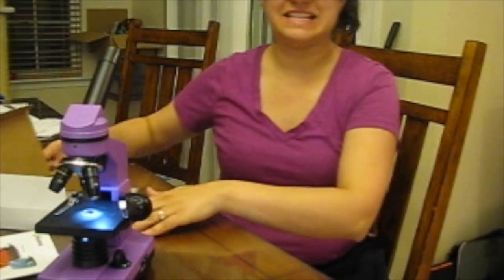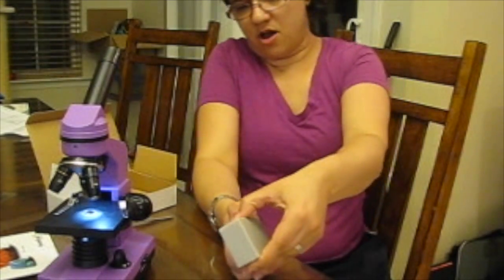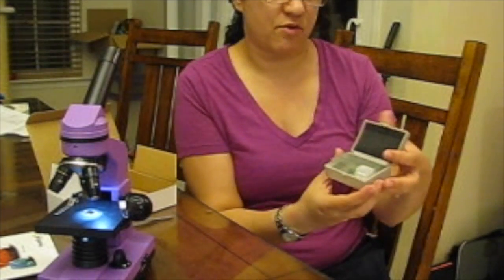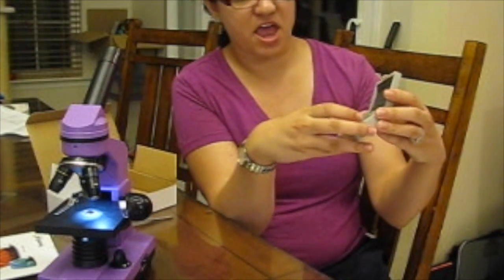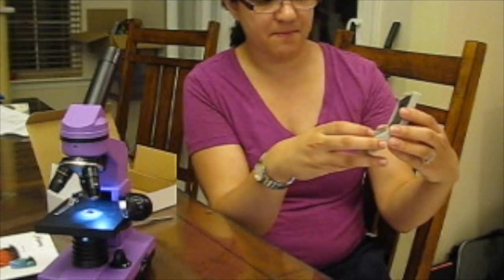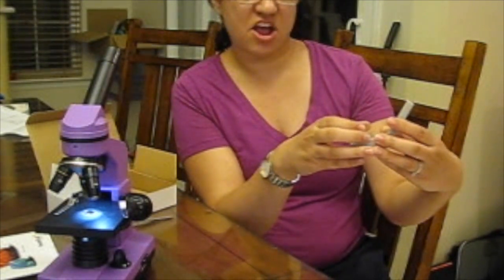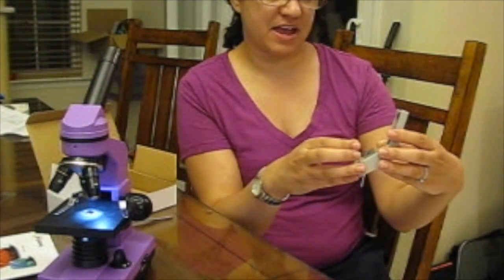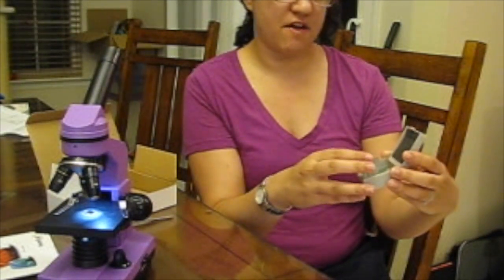So I should show it. It's not just the microscope. You get this box here. It contains four prepared slides and several blank slides - actually five prepared slides. There is a house fly leg, stem of a cotton plant, stem of a wood dicotyledon, a slice of pine wood, and a slice of onion skin.